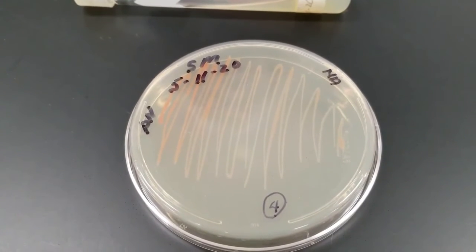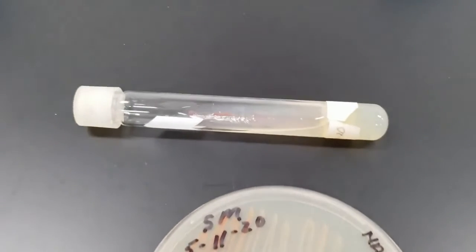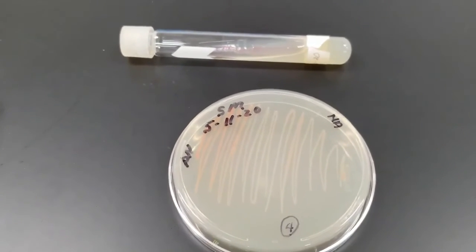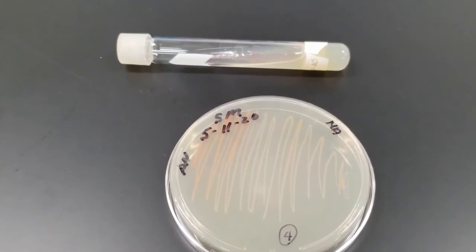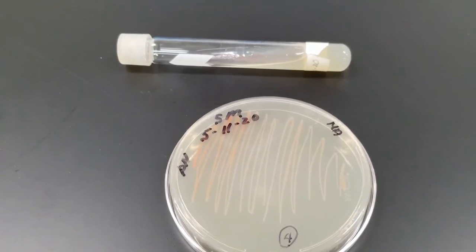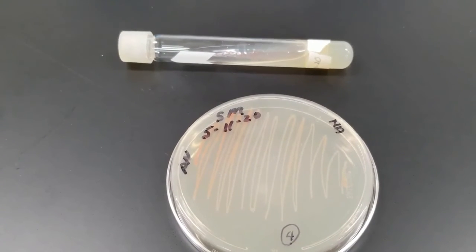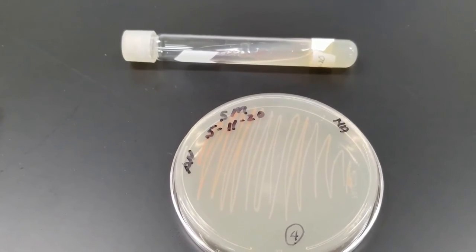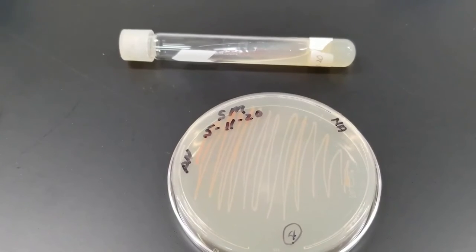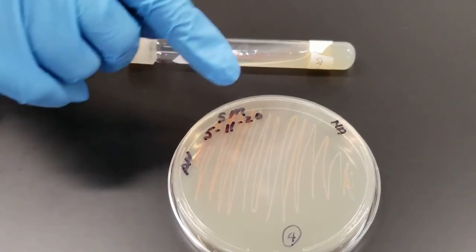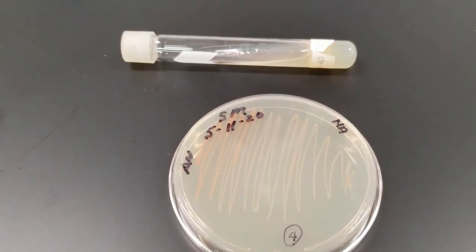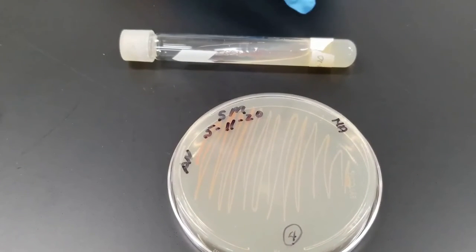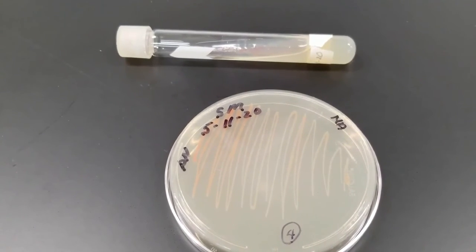As you can see, we have growth here. Bacteria oftentimes will look kind of beige, depending on the species, maybe yellowish. This particular bacteria, Serratia marcescens, at room temperature often has this reddish pink color to it. If you grow it at 37 degrees, you do not see that color. It will just be beige. But you can see on the plate the streak where we went with our loop. We have growth wherever the loop had touched, and also then on the slant. A lot of growth down at the bottom, and then it extends up along the slant towards the top.